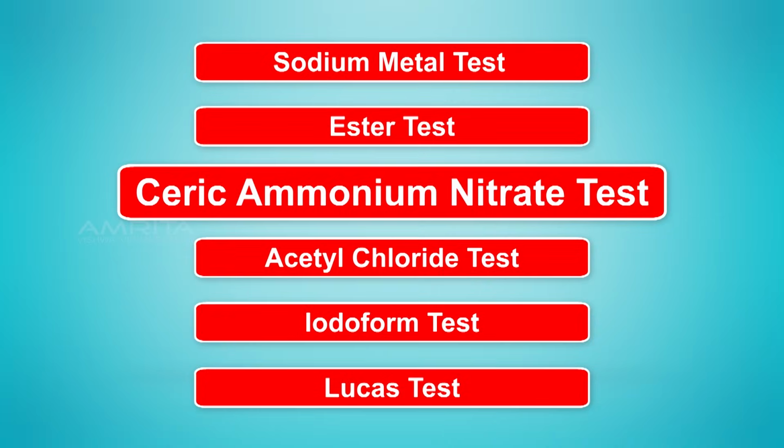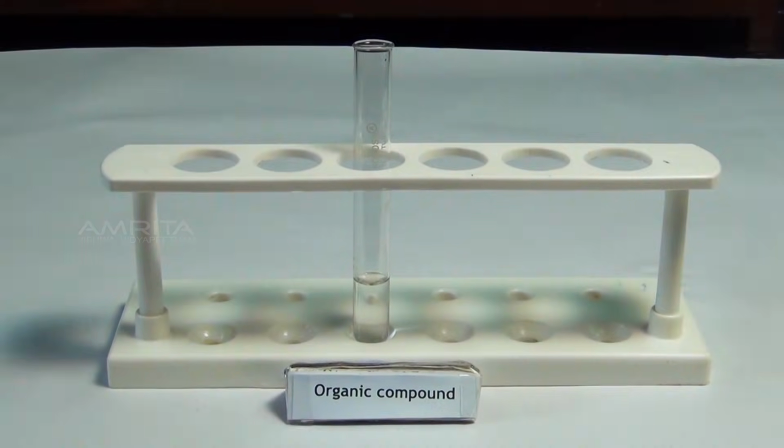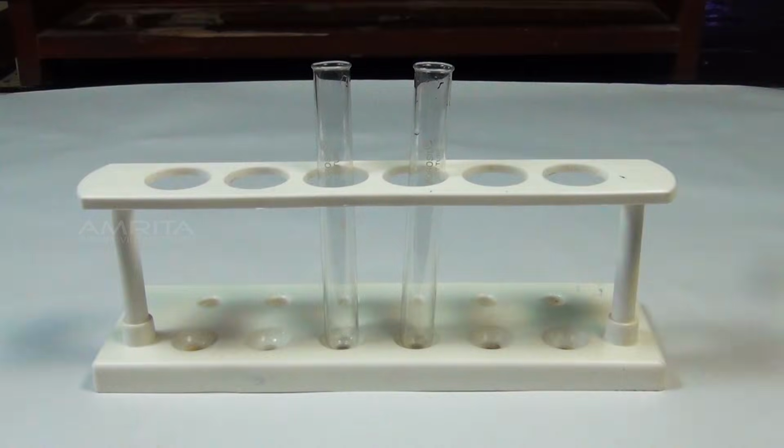Ceric ammonium nitrate test. Materials required: organic compound, ceric ammonium nitrate reagent, test tube and a dropper.